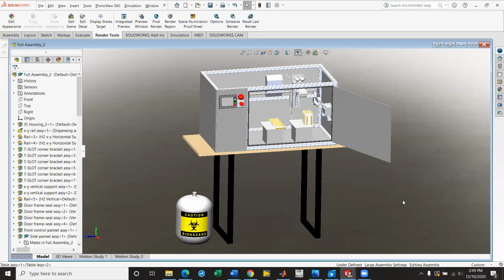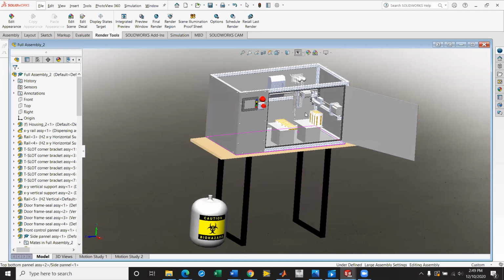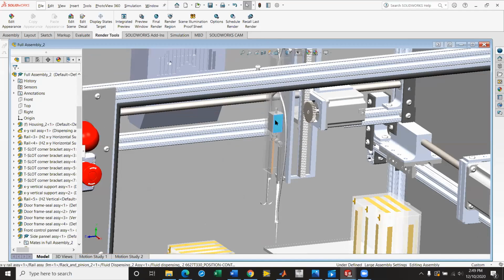Hi, I'm Chris Reich, assistant professor in microbiology. Could you walk me through the liquid sterilization process? So the liquid handler is just using tubes of some sort, and then that would have to get sterilized. Yes.